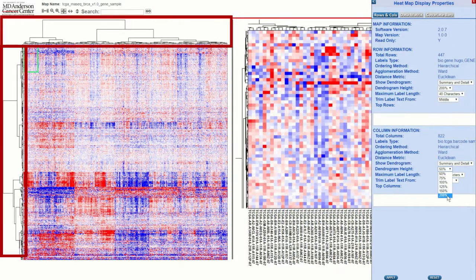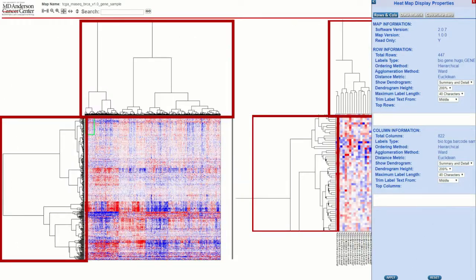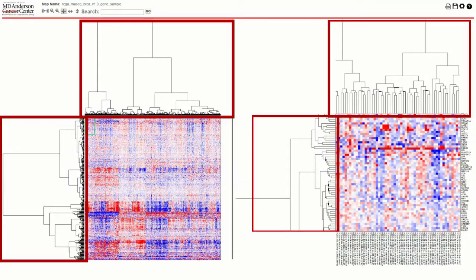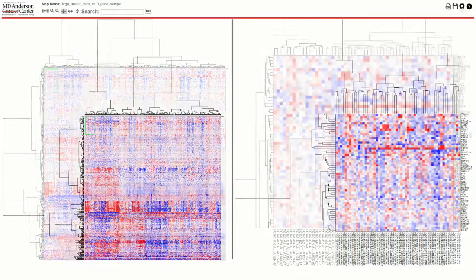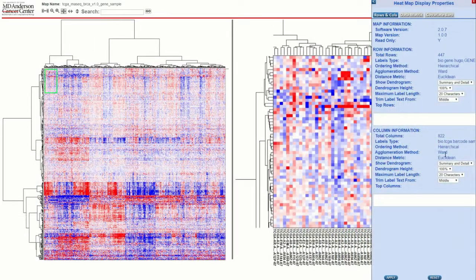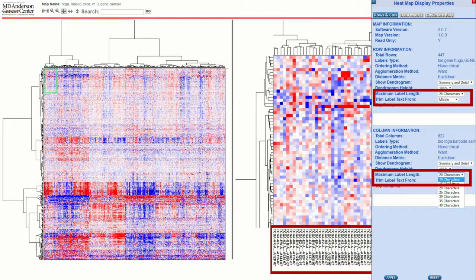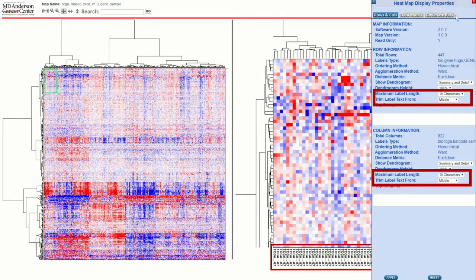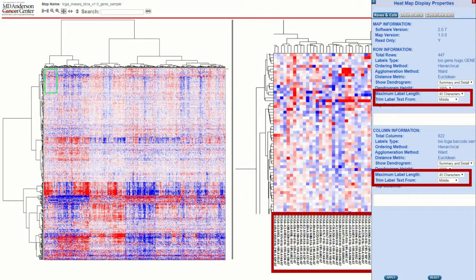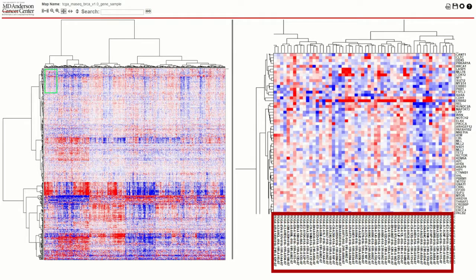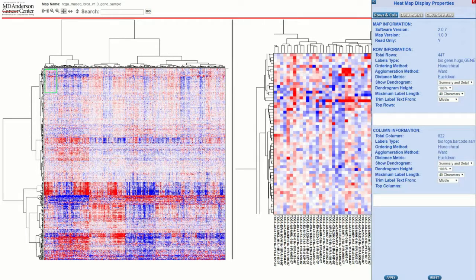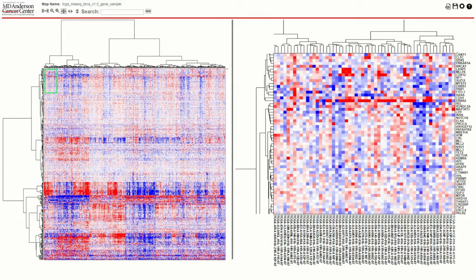You can also change the dendrogram height. At the bottom, you can adjust the label sizing. You can choose its maximum length and where you would like to trim the extra characters from: the beginning, middle, or end.